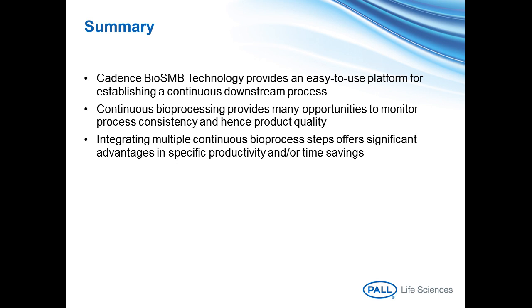And then it finds the second principal component, which is the second largest source of variation, orthogonal to the first one. So it really looks for variations rather than for similarities, and it doesn't require any additional parameters. The only thing you need to do is align the data in a certain way, and we have tools to do that automatically. And then you can load it in all the commercially available principal component analysis or multivariate data analysis software, and they immediately plot the principal components. So that transformation of data actually takes no more than a few minutes for us, and it helps me visualize large data sets in a very easy way.